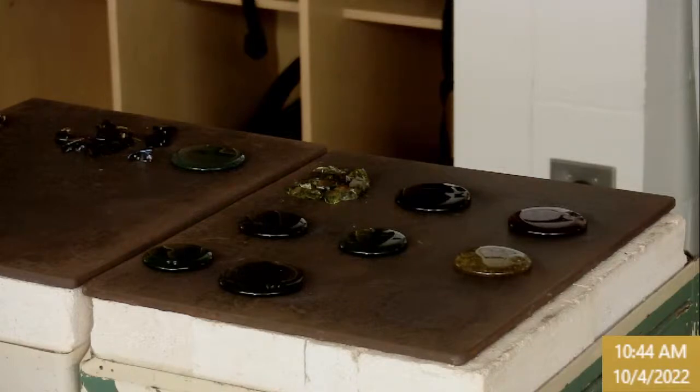So you guys can get in. Good. Now push down. Okay. Good. Hit the lip pad with one paddle. Good, man. You are on the ball. No, it's great. I'm just pushing down. Push harder. Even push harder now. Yes. Ease into it. Push harder. Push. Let them open up. Good. Push. All right. Now, when it starts to feel like it's not moving anymore, you're done. We've got as much work on that heat as we could. Now, come out. Good job.